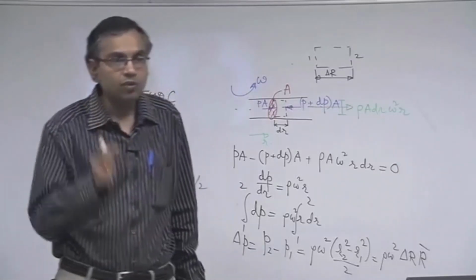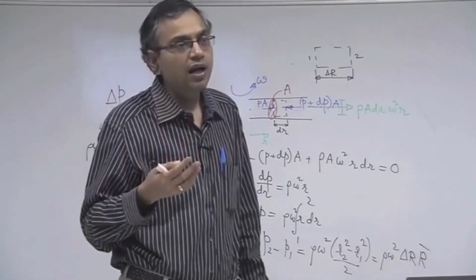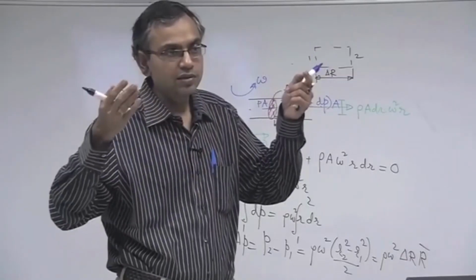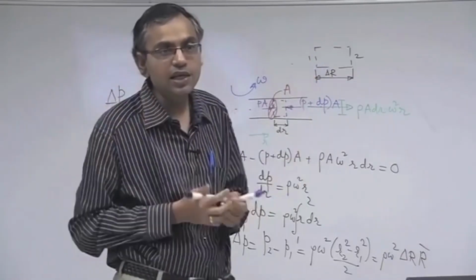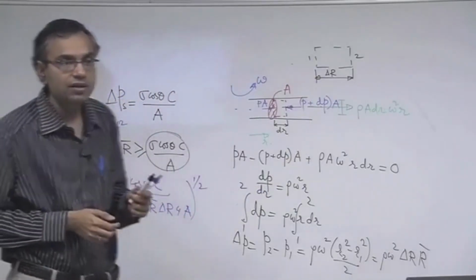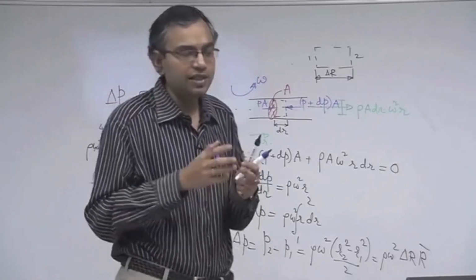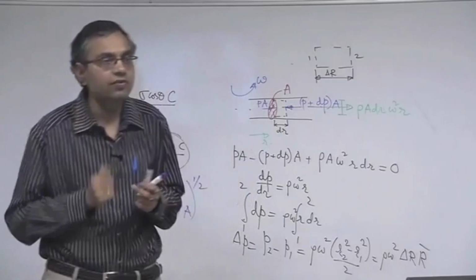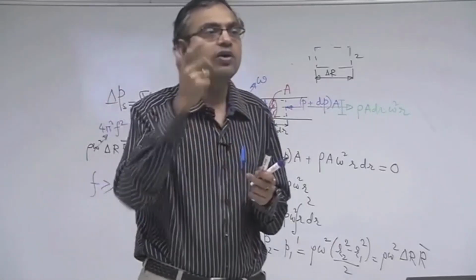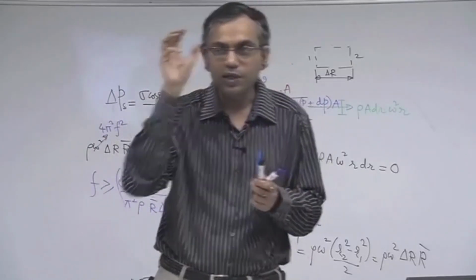That is why you want micro channels on a CD, otherwise you could have ideally had large size channels on the CD, that would have made the fabrication maybe easier, but that will have the effect of surface tension being less and less felt. So what you can do here is make the CD act like a smart centrifuge. It is possible that depending on the rotational speed you can start a particular flow on a CD.